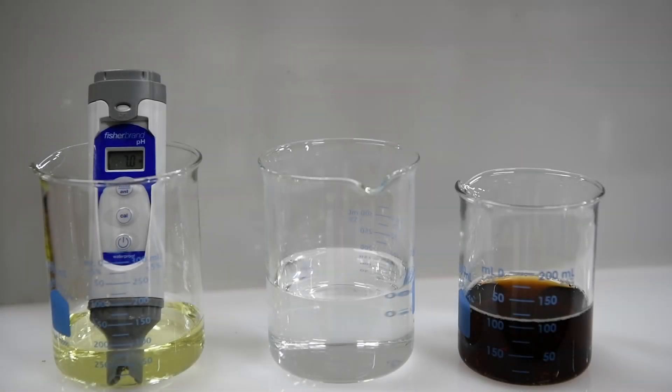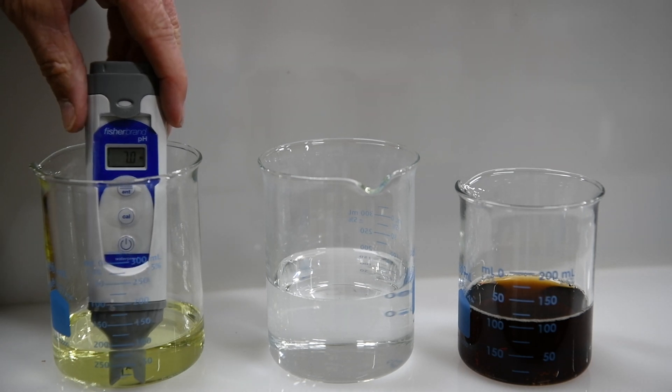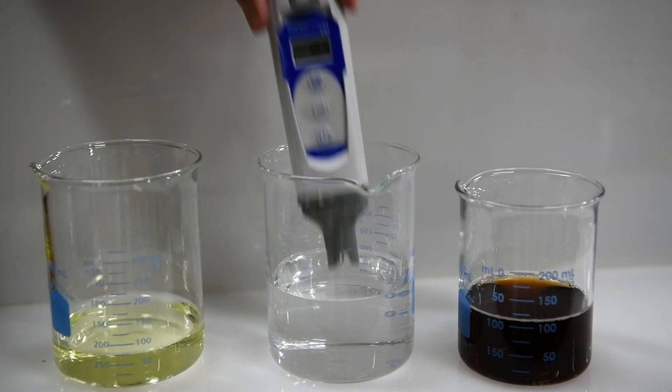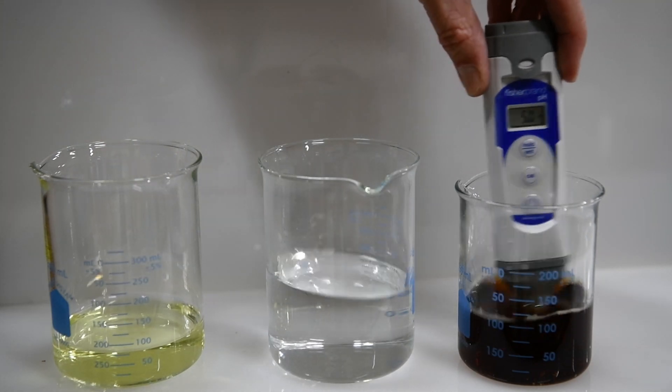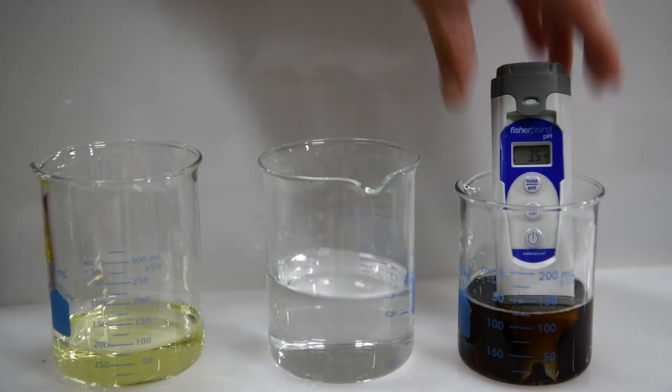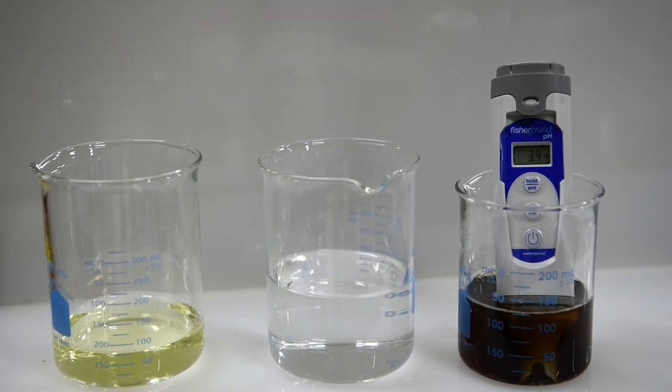Now we're going to start our pH meter tests. The pH meter normally gives much more accurate results than cabbage juice. You can see the pH meter right now is at a neutral value of 7. It's in a buffer solution, which keeps it at a pH of 7. So to test our first sample of Coke, we'll rinse the pH meter off in some water, place it in the Coke, and give it a moment to take a reading. And it appears that the pH is 3.4.